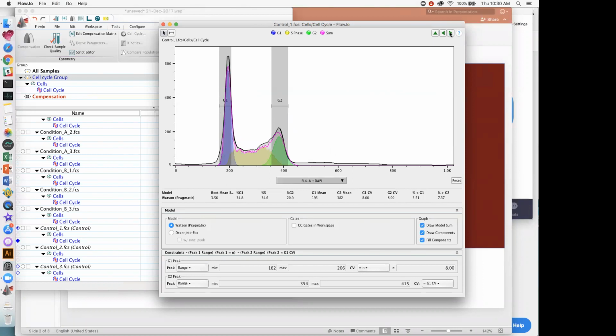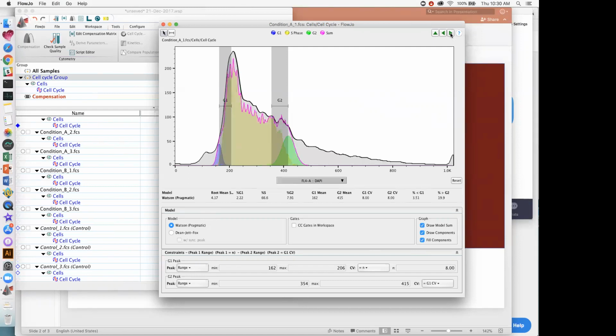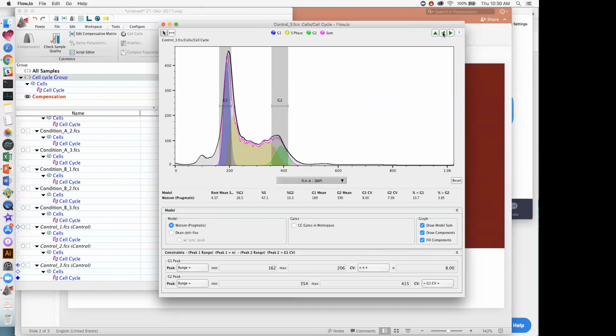This is an interesting data set in that the peak here is okay, but in some of the other treated samples, the model actually prefers the bin towards the right. Okay, this actually looks okay. So with respect to the controls, making that modification, I return here to control number 1.